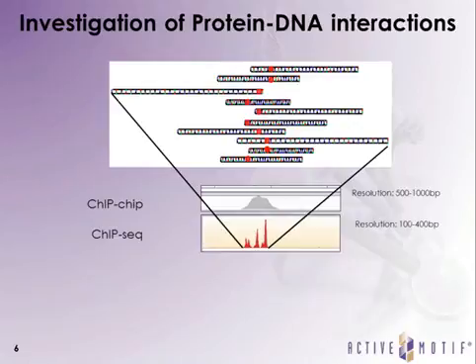This technology was replaced by the ChIP-Seq technology, which was a leap forward in the ability to identify transcription factors binding to DNA. Here you have your chromatin or DNA, which you cross-link to proteins or transcription factors, either with formaldehyde or other forms of cross-linking, and then carry out fragmentation using sonication or enzymatic fragmentation, and this generated a large amount of fragments as we see here.